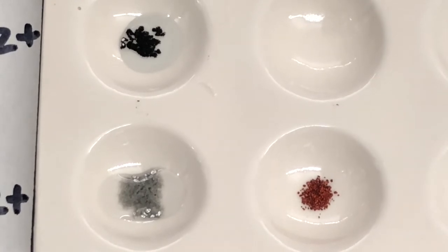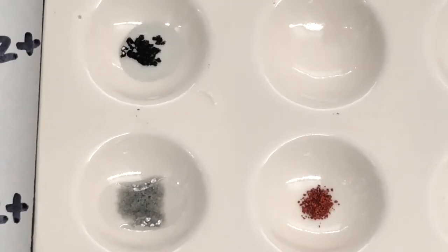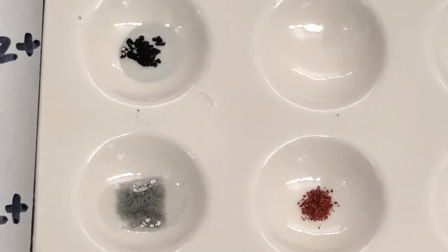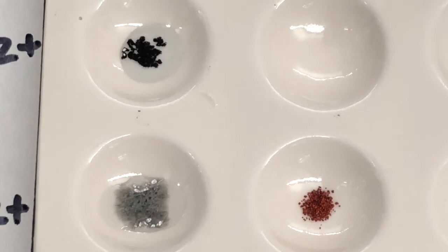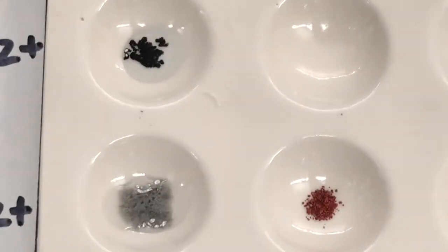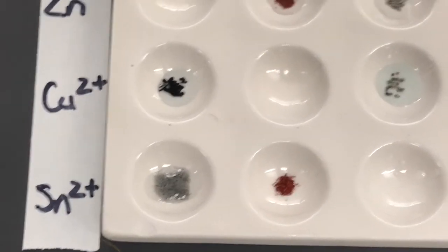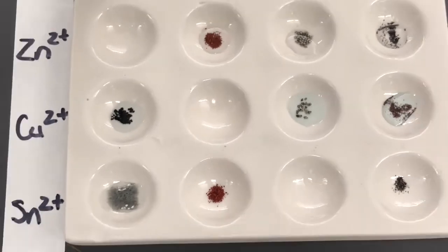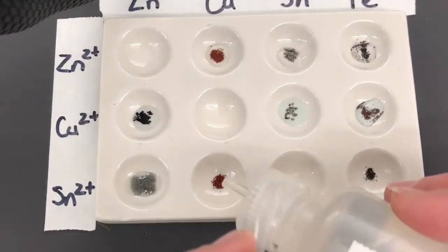It turns out that to make the tin 2 plus soluble, I had to add some acid to that solution. So the bubbling is a function of the acid, not a function of the tin 2 plus reacting with the zinc. So certainly this is an example of a reaction taking place with the zinc. Okay, so we can move on to our next reaction of copper with tin 2 plus.